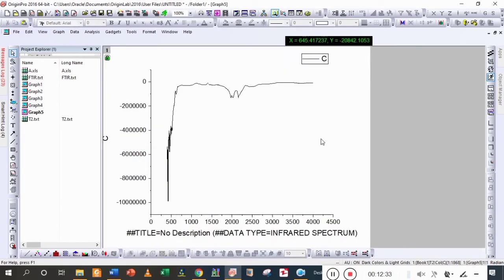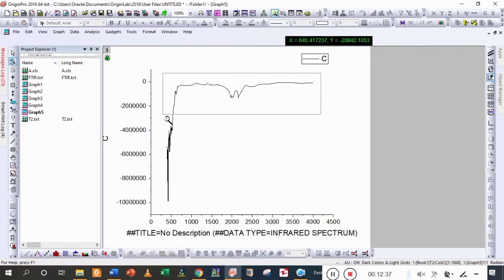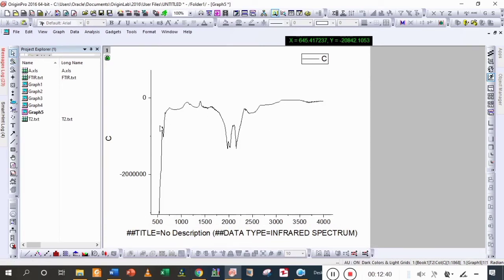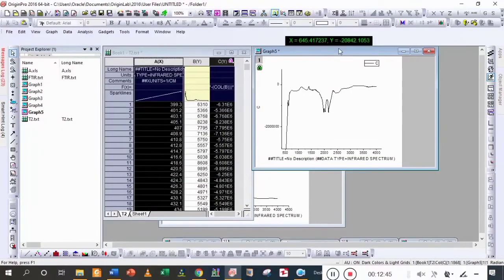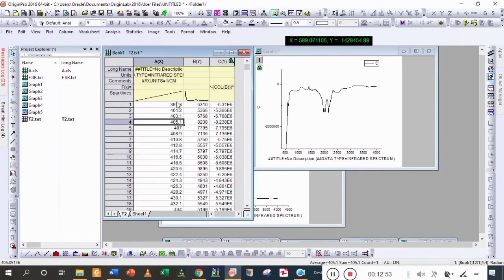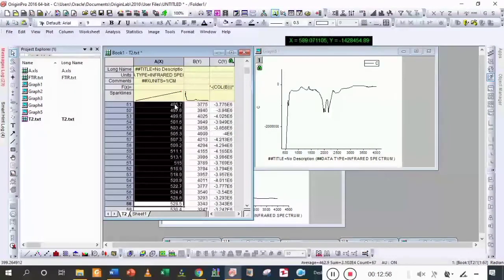You can see that noisy data is here, so we are going to remove it. First zoom it, and noisy data starts from 589, so we are going to delete the 589 value.